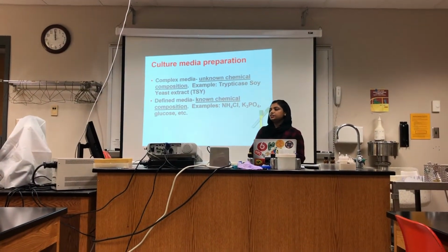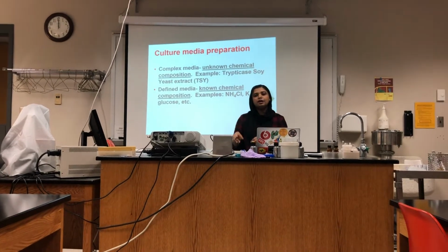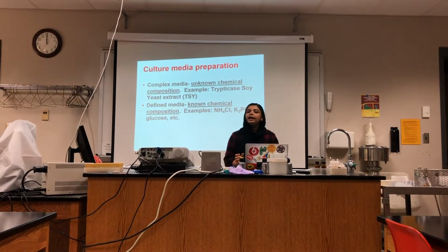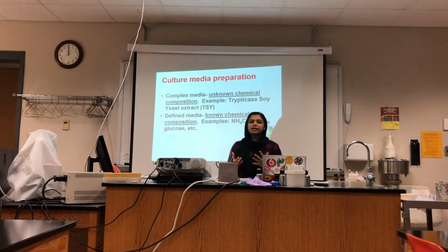Next one is the culture media preparation. Culture media can be solid media or liquid media. For this lab, we will be doing the solid media preparation. Before going into that, I just want to tell you something about the different types of media.